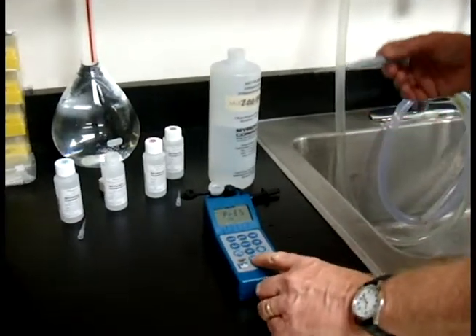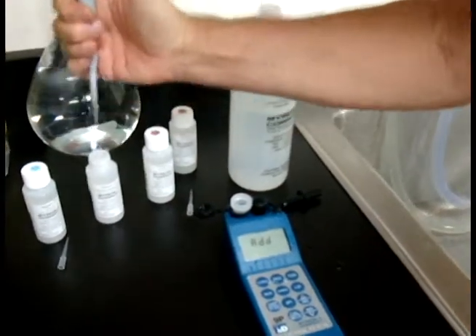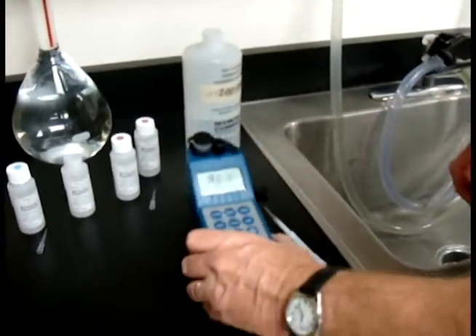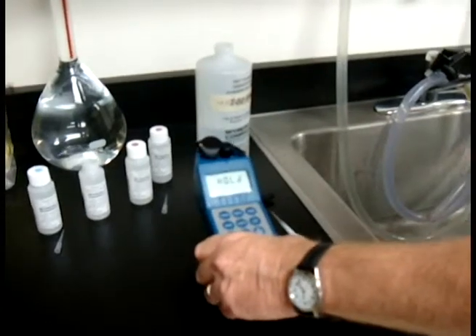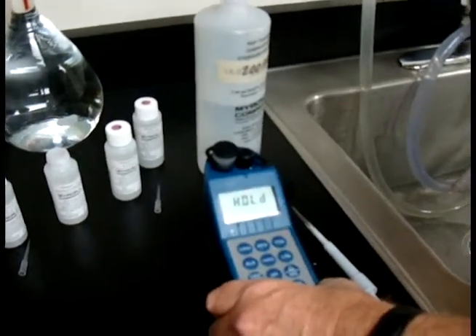Press Cal. Now when we press Cal it's going to ask for H1, so let's go get some H1 and put that in. Close the cap and agitate as it says. Again, three or four good little shakes is all it needs. Agitate, then hold.